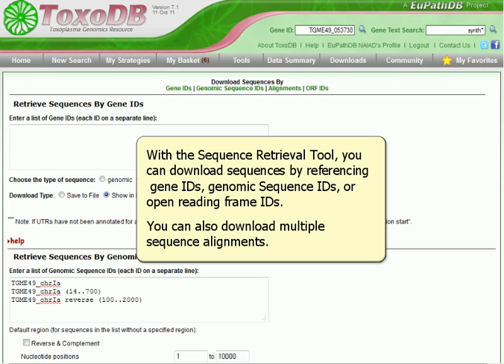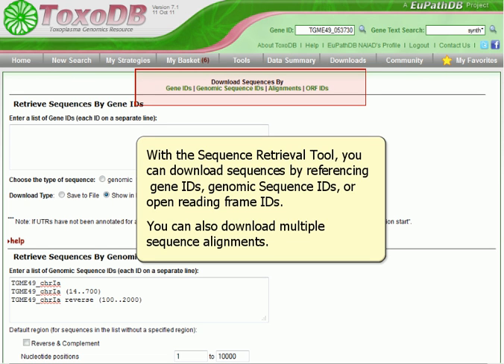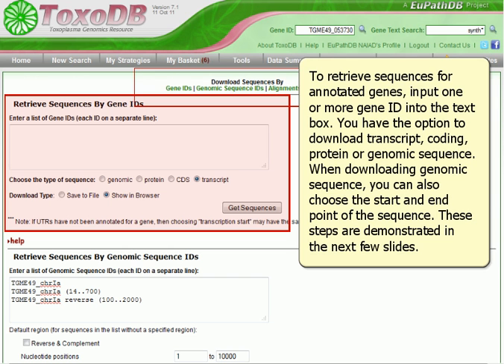With the Sequence Retrieval Tool, you can download sequences by referencing Gene IDs, Genomic Sequence IDs, or Open Reading Frame IDs. You can also download multiple sequence alignments.